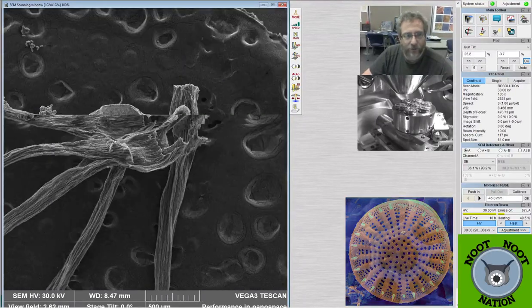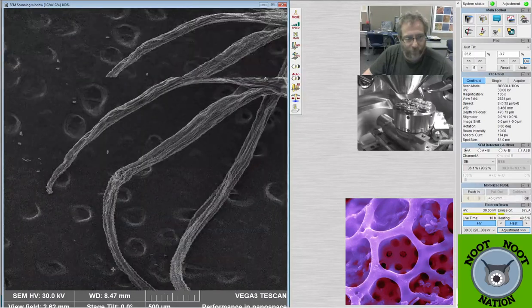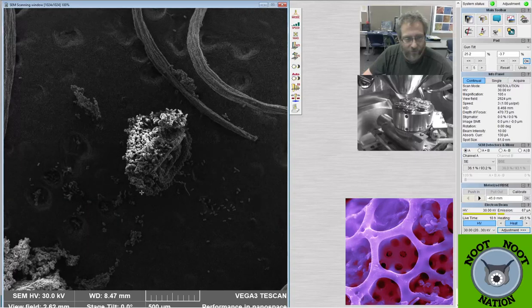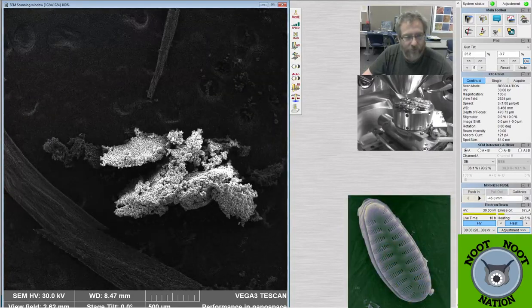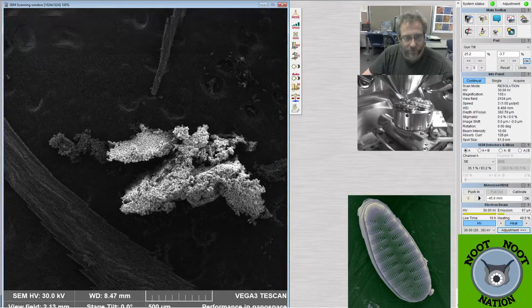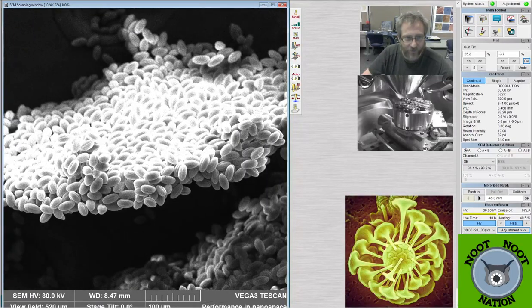I think we can actually move on. I've captured just about as much as I could get from the redbud here. I suppose I could come down here and show this. There are some parts of the plant, the anther, that generates the pollen grains, and they're usually swarming over that surface, like right here. You can see that.